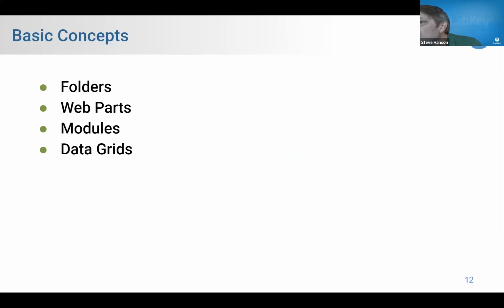I see a question here. Somebody asks, Excel has a lot of formatting issues. How are these handled during the upload to LabKey, such as data formats, et cetera? That's a great question, and I wanted to call it out because it's exactly what I want to do today during my deep dive. We're going to do a deep dive on data grids, and I'm going to take an Excel file and move it into LabKey, and we're going to touch on some of those problems as we go. And then we're going to do it again on day 2. It's a great topic. Lots to say about it.